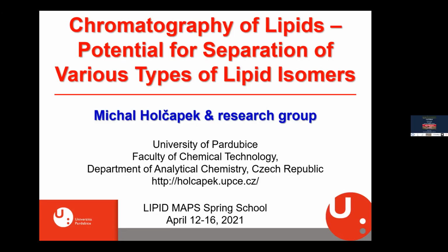My own lecture is focused on the possibilities of chromatography for the separation of various types of isomers of lipids, which is based on more than 20 years of experience of my group with LC-MS analysis of lipids. So really many people contributed to this work over the years, and I'm not able to list all of them in the title here.